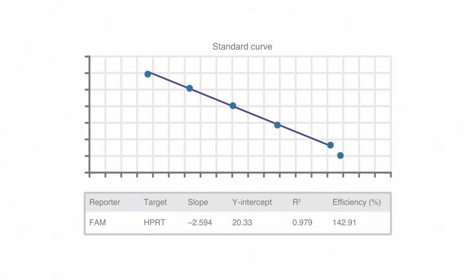Let's check some other data for outliers. Here's one that looks suspect. If the standard curve looks good with the exception of a point for the most concentrated sample that appears at a later CT value than expected, then it is likely that this dilution point indicates inhibition. Let's omit the point and reanalyze.